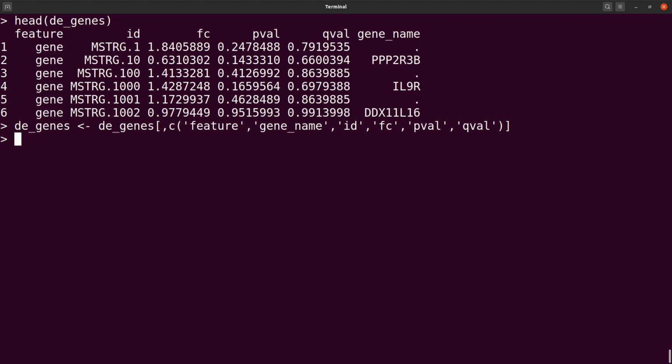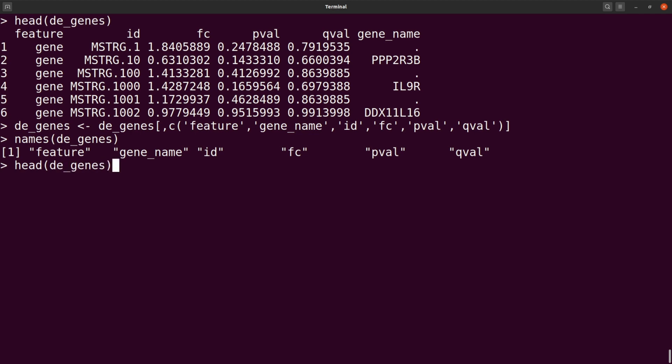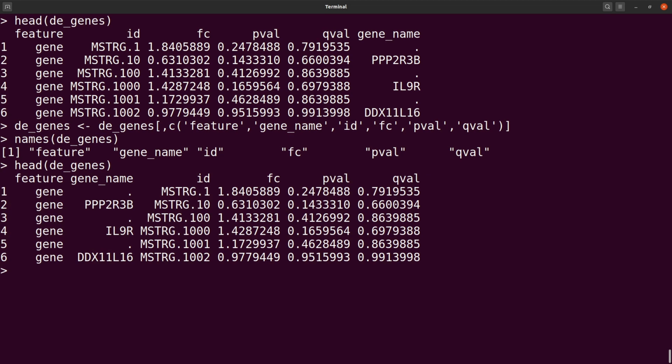So now we can confirm by saying names, DE genes. So this will give us the columns. So we have feature, gene name, ID, FC, and all that. So we have it there. Okay, so that's what we have. So we can say head DE genes, and we have that also here.